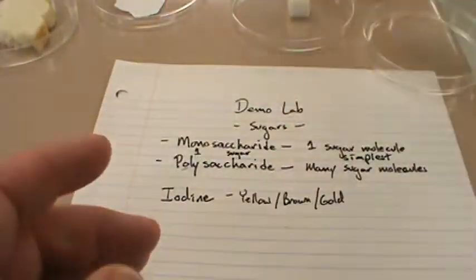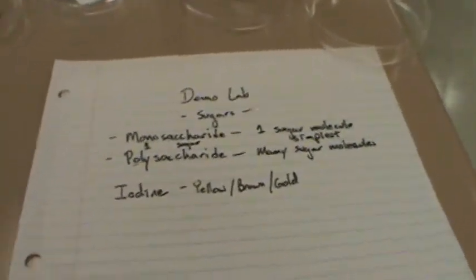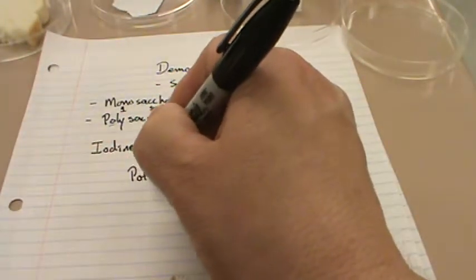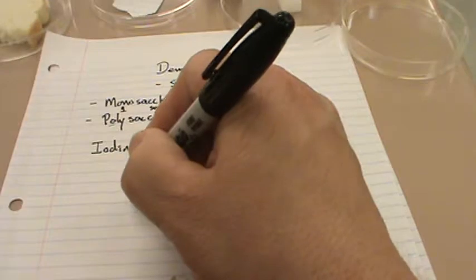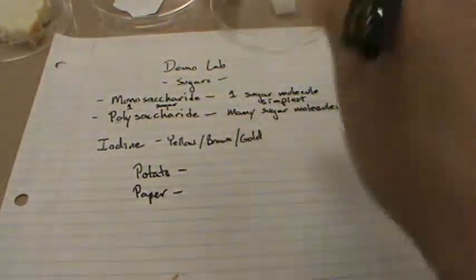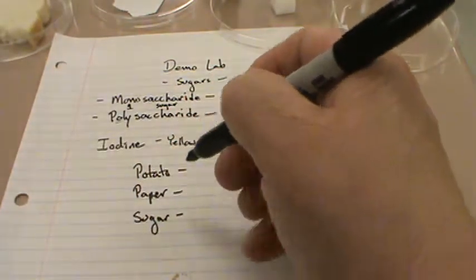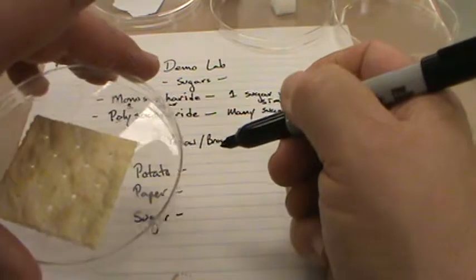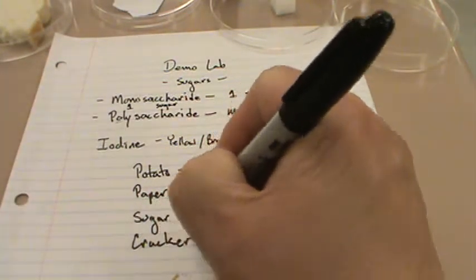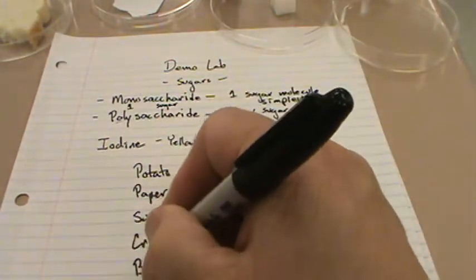And so we're going to test these items that I just showed you. So on our paper, what we did was we wrote down potato, paper, sugar, I've got a cracker right here, and the bread.